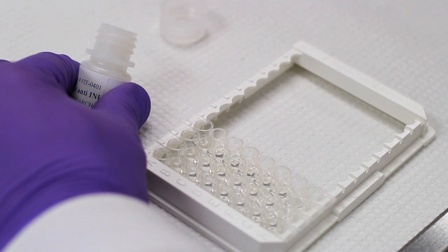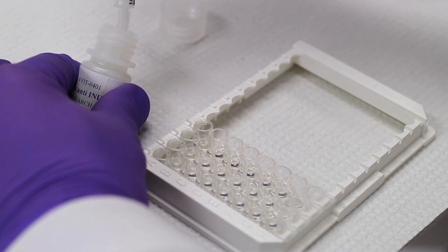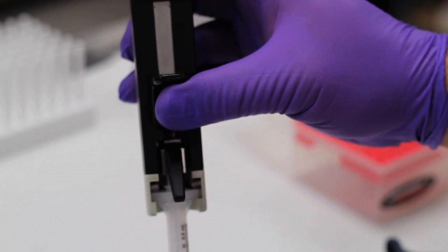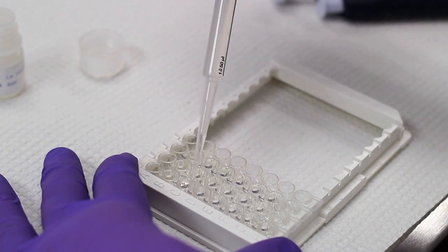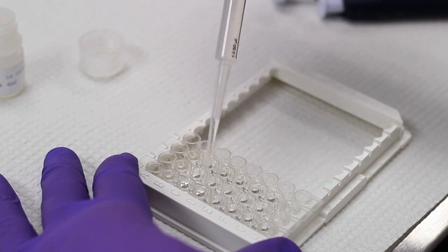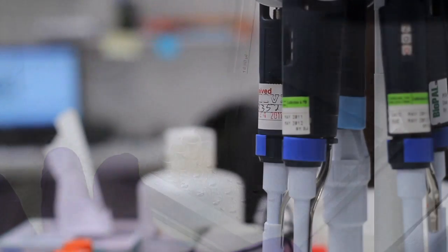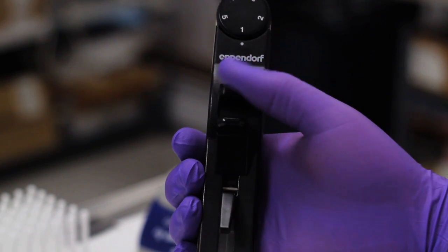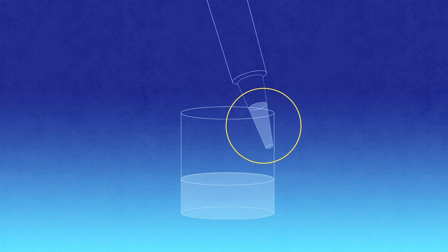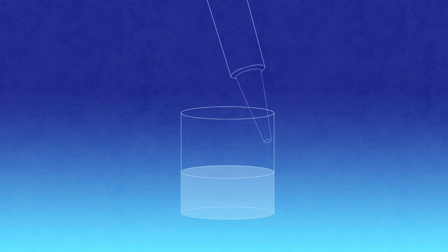After all wells have been filled with sample, it is time to add the rabbit antiprobe. If you are running the inulin kit, the label on the bottle will read rabbit anti-inulin. If you are running the iohexol kit, the label will read rabbit anti-iohexol. For this application, it is best to use a calibrated single channel repeating pipette set to release 50 microliters. To prevent cross contamination, the pipette tip should be placed at the top of each well and should never come in contact with the sample.